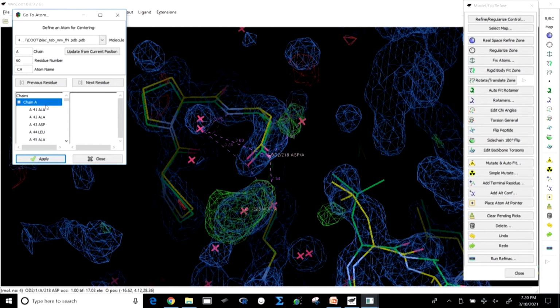So it is difficult to solve them, or sometimes, like here, we ourselves cut out that portion so that we make our overall protein more rigid. More rigid protein means more stable protein, more production of the protein. This is also one type of protein engineering which we are going to discuss in our last 2 modules.